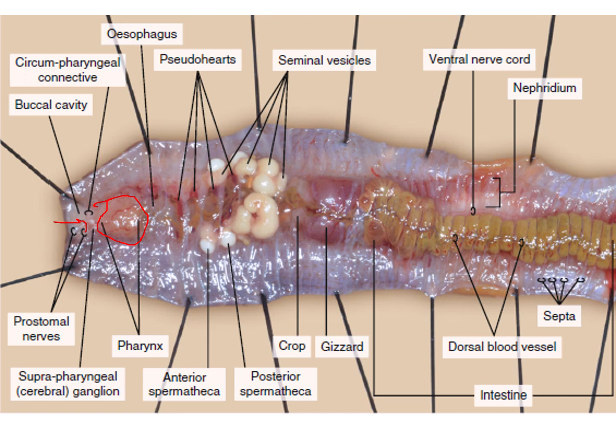The esophagus was hidden under the reproductive organs and the pseudo hearts. So here we can see the pseudo hearts. These are the blood vessel like hearts. They are passing from one side of the esophagus to another side. We'll see them later. And then there could be certain calcareous glands present over here.